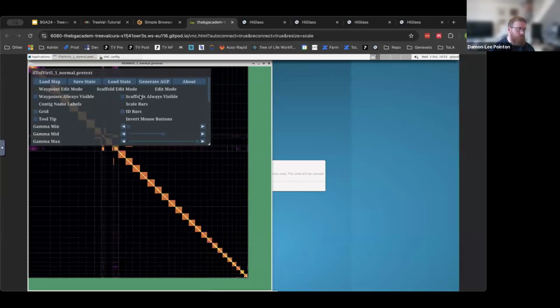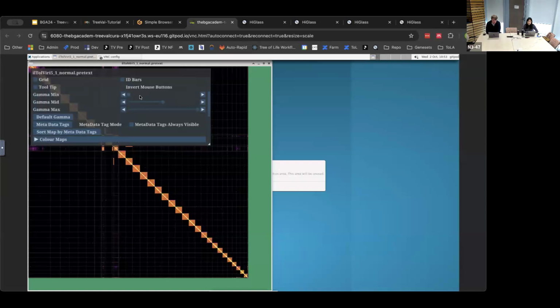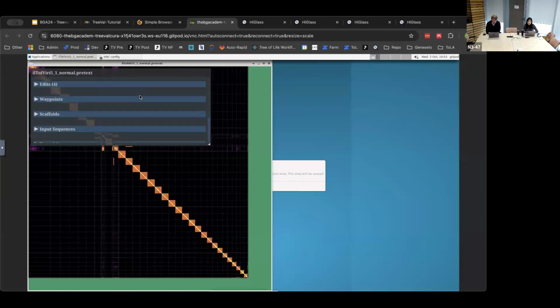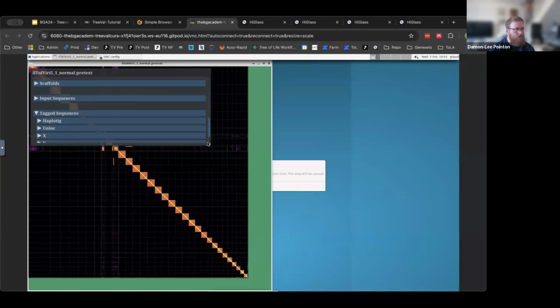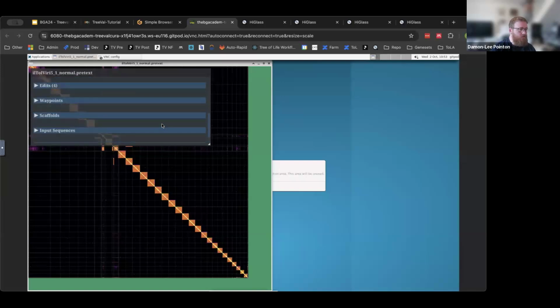Can you try opening some of the tracks that should have been loaded into this Pretext, please? Doesn't look like they were. It doesn't have the extension. Normally the tracks for gap, telomere, coverage and whatnot are ingested into the Pretext, so you can see them on both the HiGlass and Pretext map, which is very handy for the curators as well.